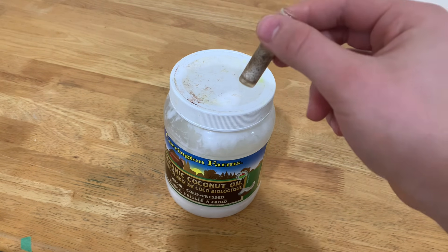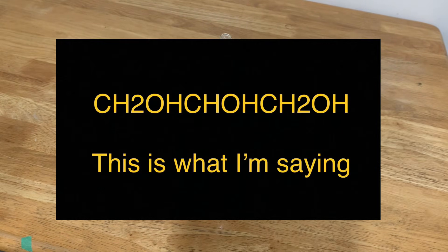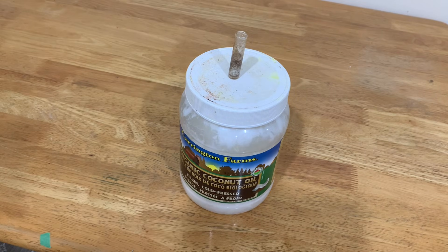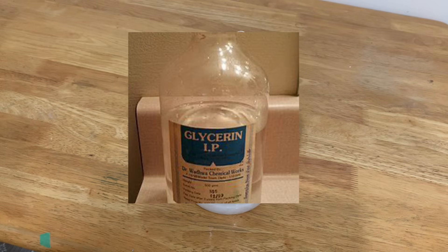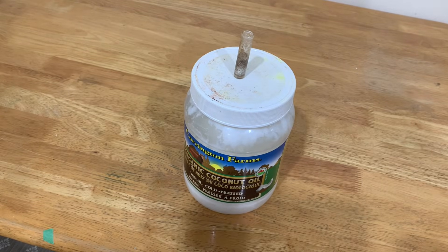Now what is glycerin? Glycerin, or glycerol, is basically an organic molecule which is liquid at room temperature — which I already admire — and can be used as a solvent for things.